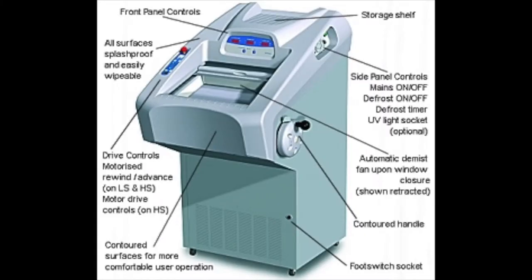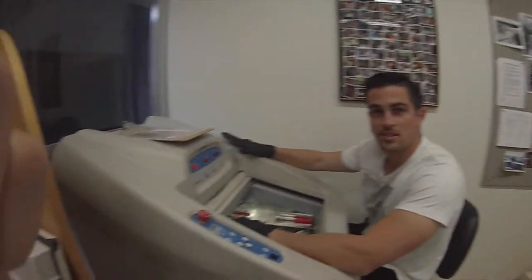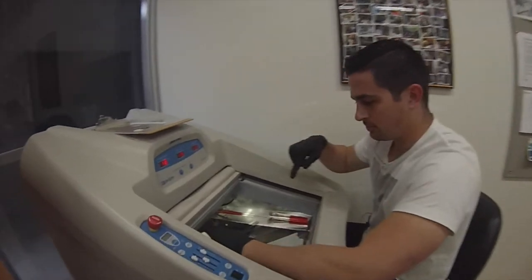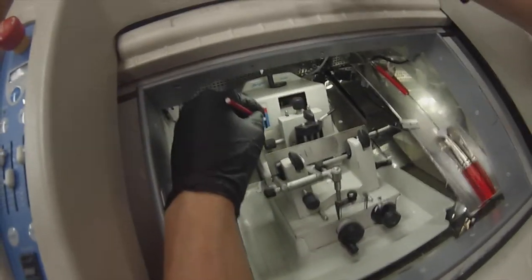This is the cryostat I'm using today on the right side. There's a dial that you can turn and that moves the sample so it cuts on the blade. This is the cryostat in my lab and we're going to be cutting thymus today. Let's take a look inside — we have the blade and we have the chuck which moves around.